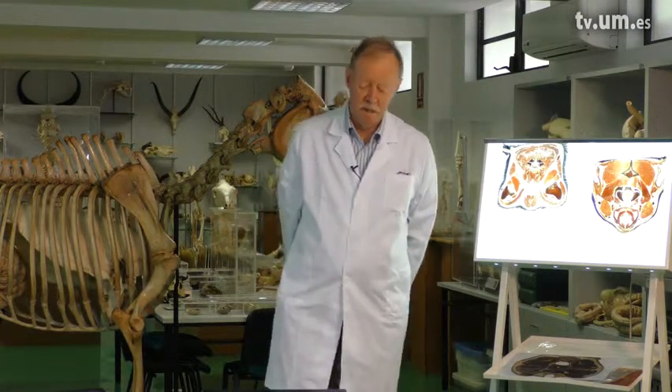For these videos, we use original anatomical specimen from the Department of Veterinarian Anatomy of the University of Bursia. Furthermore, this module contains extra contents like evaluation and questions.